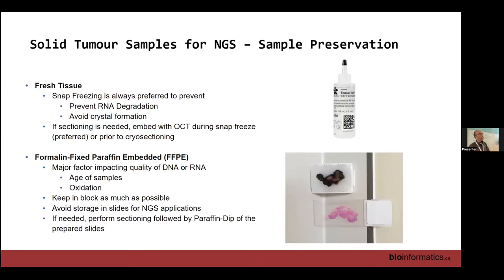It does. I think it is hand in hand too, because especially in your FFPE samples, your DNA and RNA and your DNA proteins are also cross-linked. So your whole stabilization may also get affected by that.